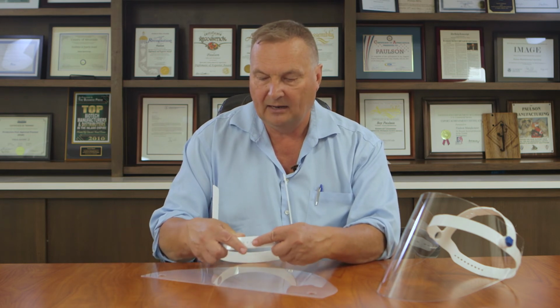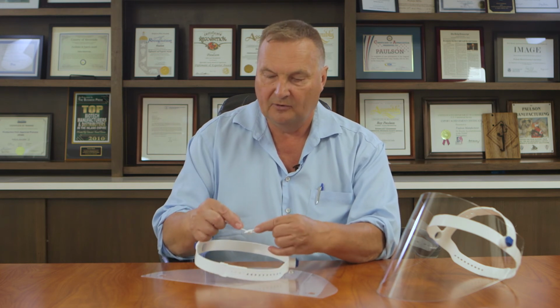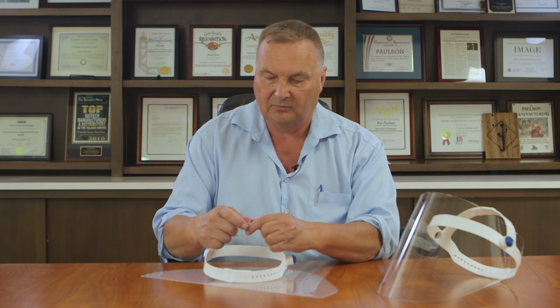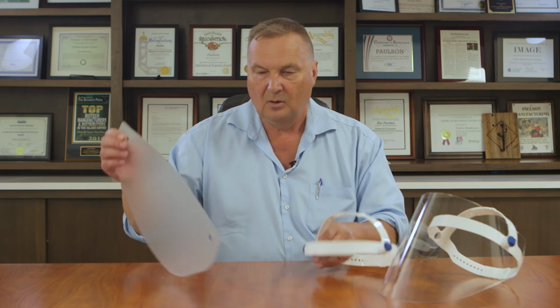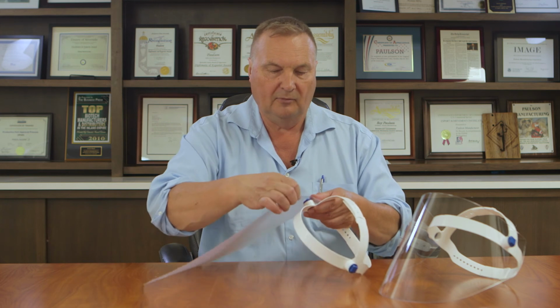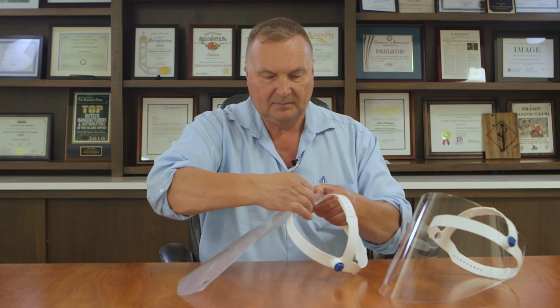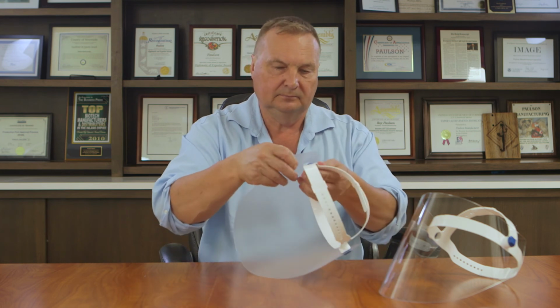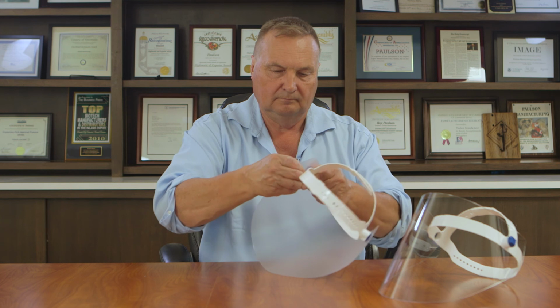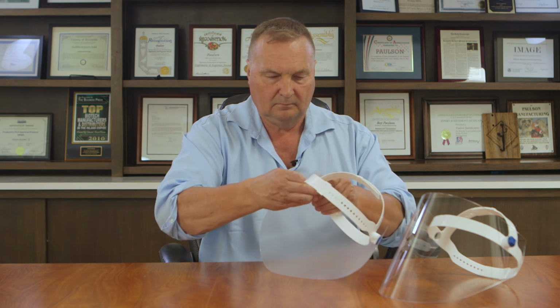Slip this on the back for the nape strap and select your hole position. Put this over the top and select your position for your crown strap. Take the face shield, place it over the snap system attachment, snap it into place, bring this around, and the product is ready to use.